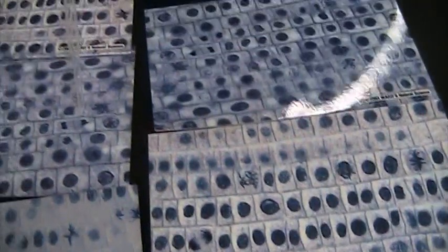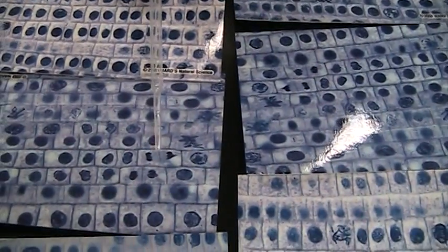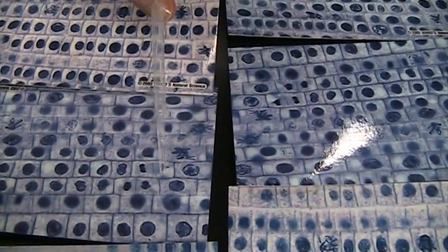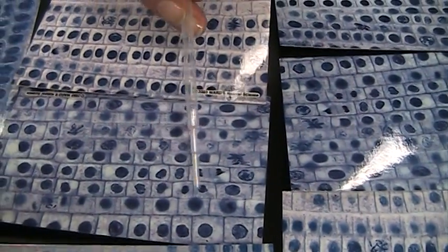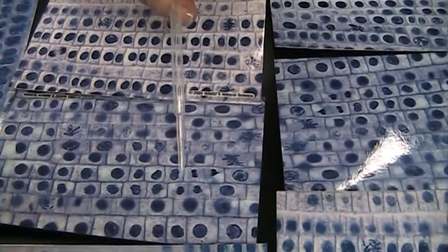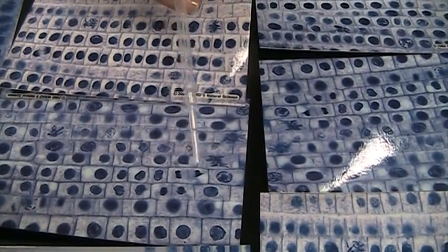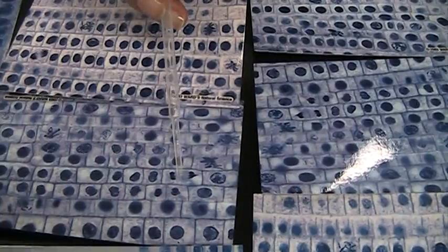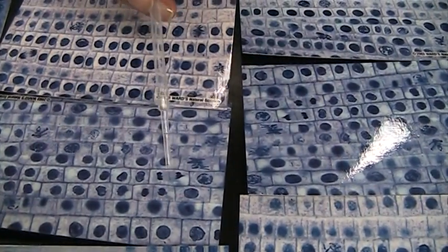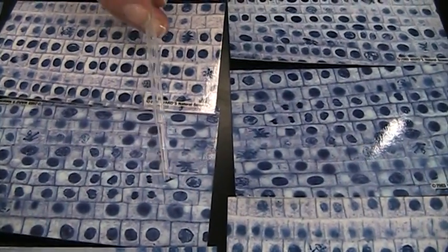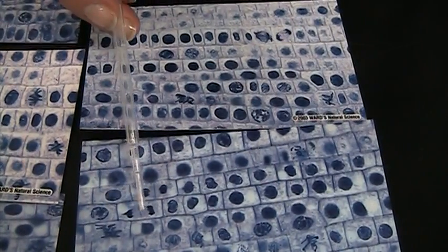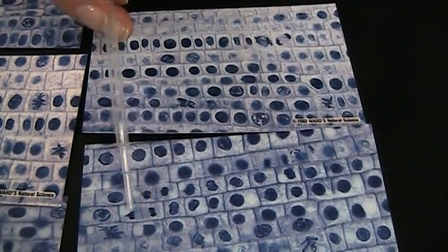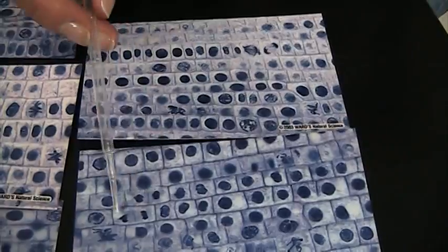Telophase is cool because you're going to start seeing the plate form. So this is still one cell. You can see that here's a distinct cell, here's a distinct cell, here's a distinct cell. This is still one cell. Those chromosomes have pulled to opposite sides, but now you see that plate forming in between the two, and it doesn't go all the way through. So that's a definite telophase. This one right here, probably the same. So this is still one cell. That plate is forming between the two, but it's not quite complete. So this would be a telophase.